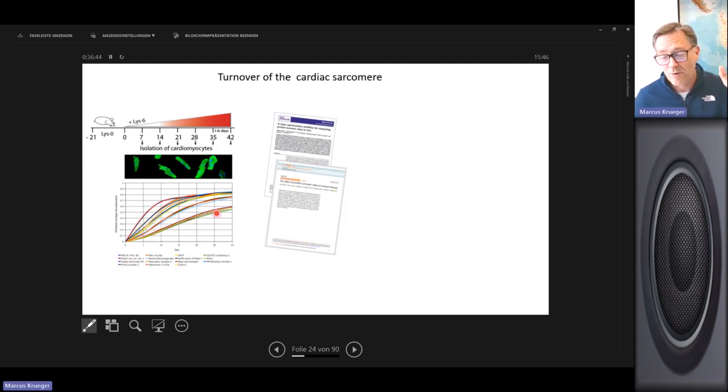One reason for that is the recycling of amino acids over these 6 weeks. Whenever a protein is degraded, a light protein and a heavy protein, it is fed back up to 80% into the amino acid pool and into protein turnover, and that gives us this delay.